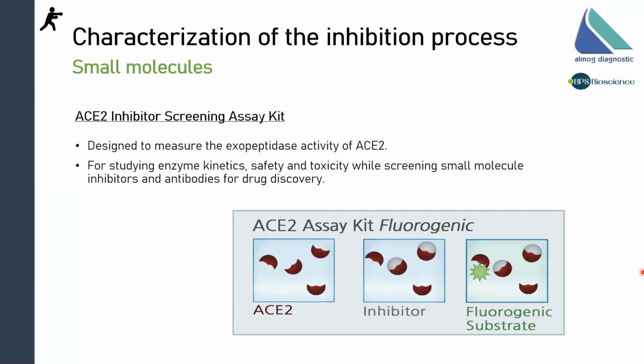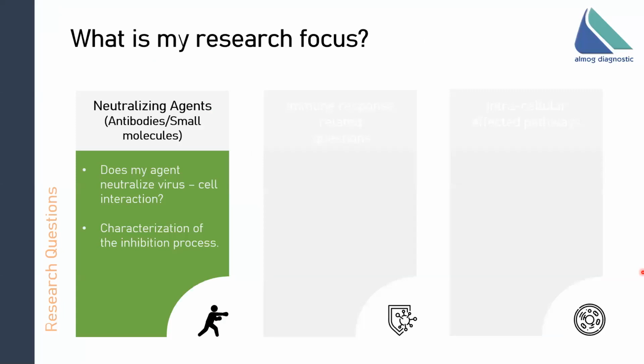You need to keep in mind that the ACE2 has a crucial role in the host body, and you wish to know upfront, before you're actually getting into clinical stages, if your molecule, if your chemical agent, is safe and not toxic to use. So these are both assays that you can perform to characterize your interaction and your inhibition. So as for now, we covered the first topic, which was the neutralizing agent, and we answered both questions.